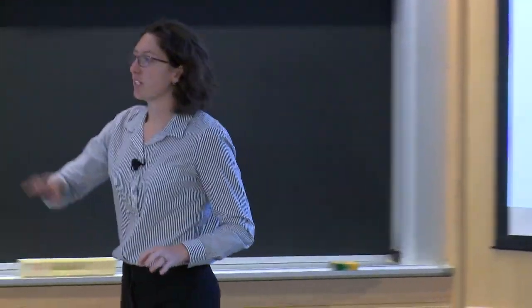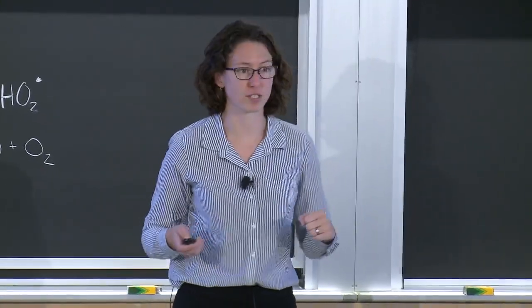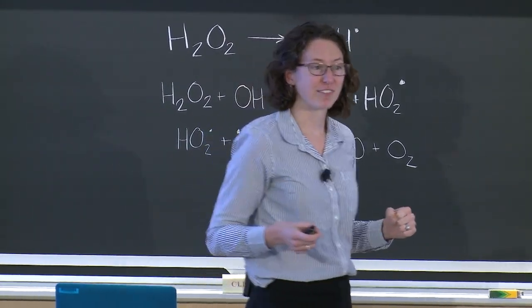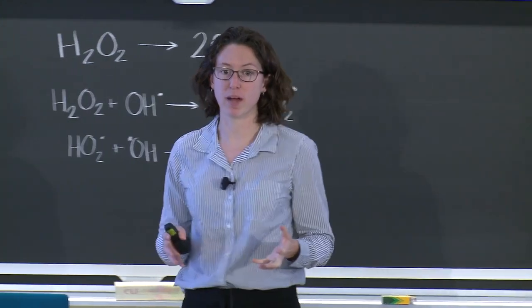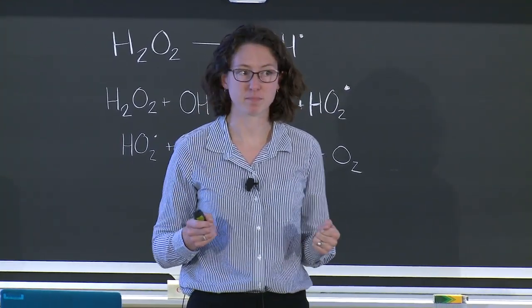So when you get your data, you'll need to figure out where it is most linear, where the slope is the steepest, and that is what you will use to calculate your unknown concentrations. And then it is just like you did for phosphate, and you will be able to calculate your unknown concentrations. Any questions about the quantification of the amount of catalase protein?